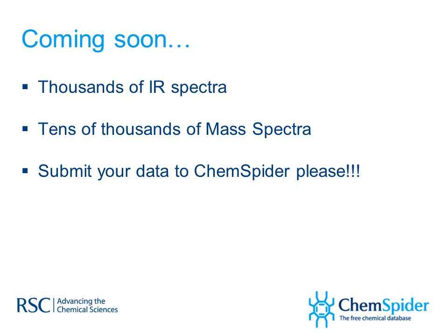What we have coming soon is we will be adding thousands of infrared spectra to the collection on ChemSpider, so they will be available. They will also feed into other parts of the system, such as Learn Chemistry, as well as hopefully extending the SpectralGame over the next few months. It would be great to see whether or not we could add infrared interpretation, etc. We're also going to add tens of thousands of mass spectra, and we really encourage you to submit your data to ChemSpider if you would. Please feel free to contact us at ChemSpider and discuss with us whether you have collections, and we can probably use that as a batch collection to deposit.